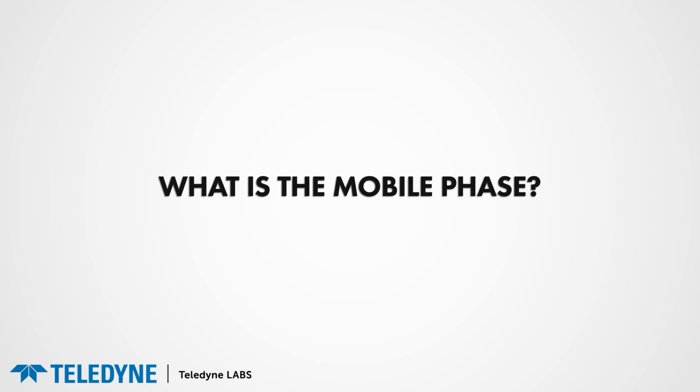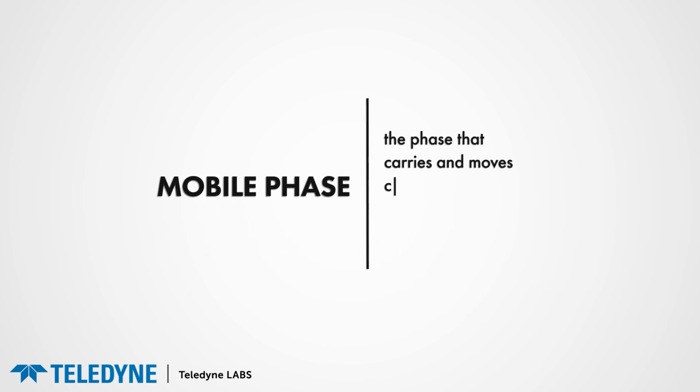Again, the mobile phase is exactly what it sounds like. This is the phase that's going to carry and move components of a mixture throughout the stationary phase.